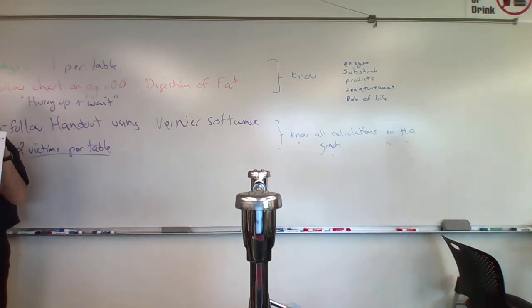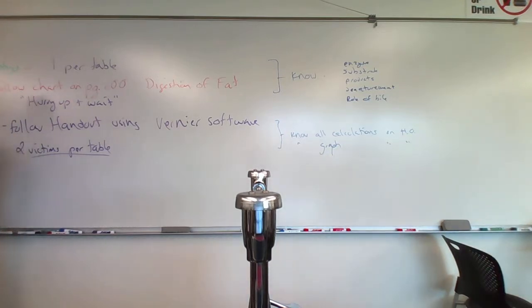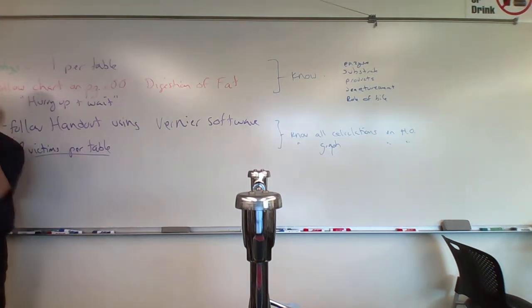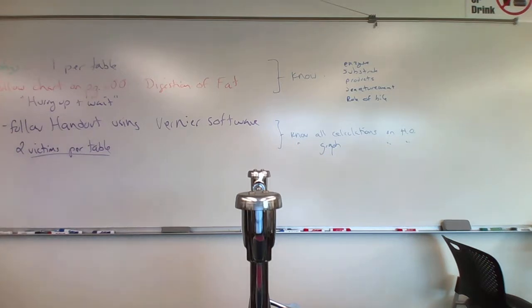Where it says 1L, that's your first test tube you're going to label. What's in the test tube? What does the yellow and the blue represent? Lipase and water. So remember biology 112, lipase is an enzyme that digests fat, right? That enzyme is back here.